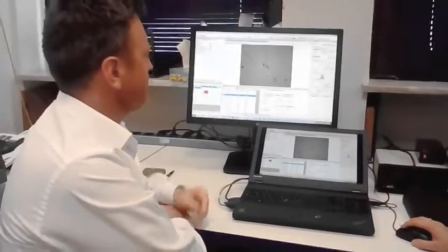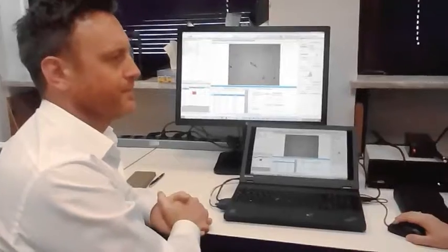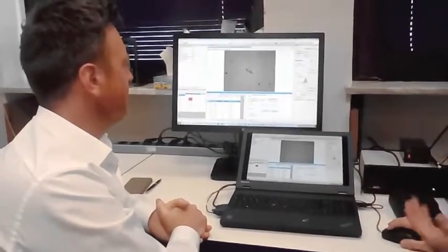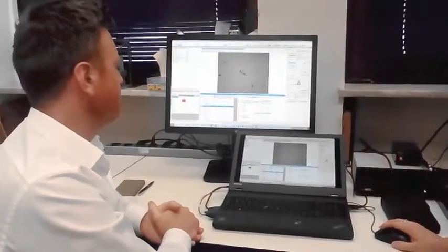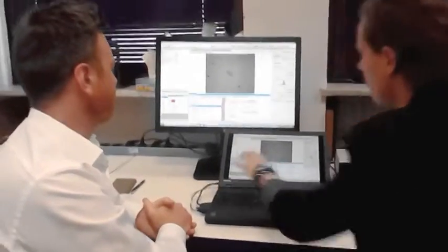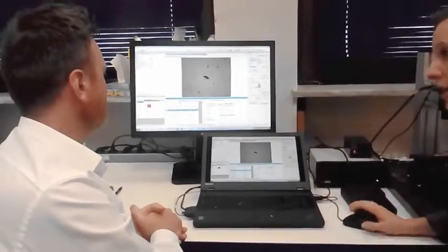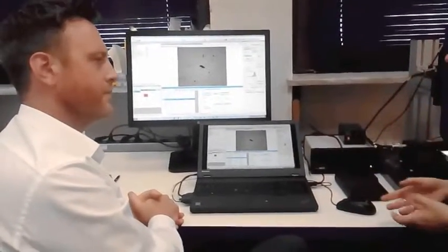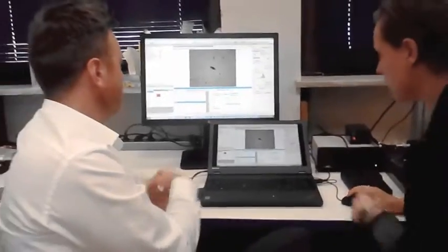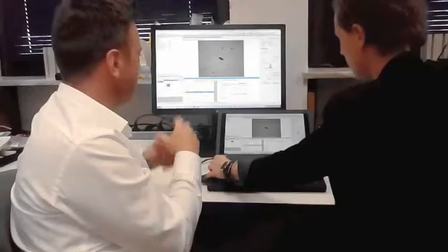Yeah, so you might do this, for example, if you just wanted to take the top 5 biggest particles. For example, I want to highlight them because most probably they will cause the major damage on your component. Right, I see. So for many customers, it's quite interesting that they are reported in a separate slide. And this is all leading to us showing you the report module, which is coming next.